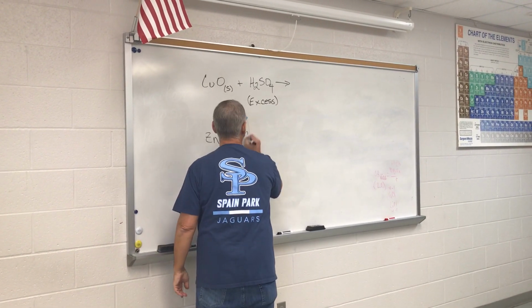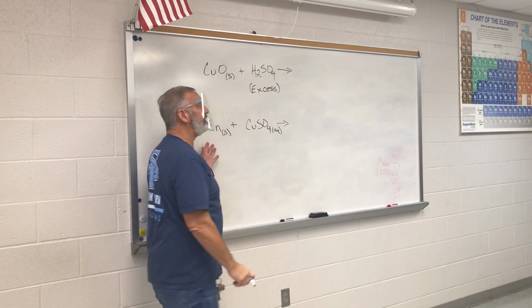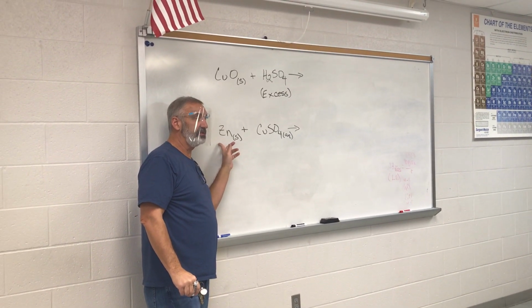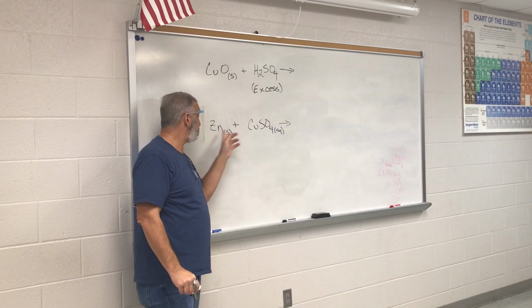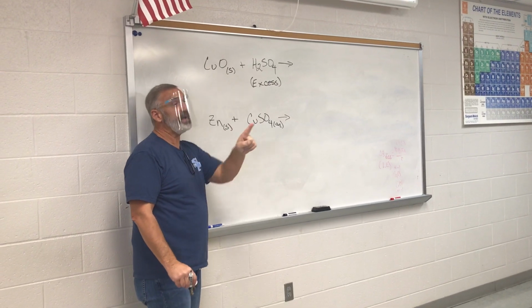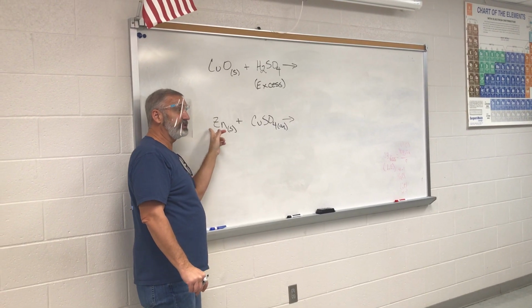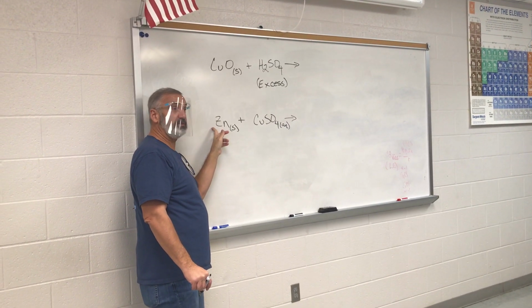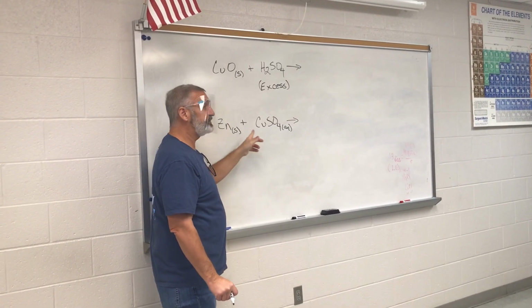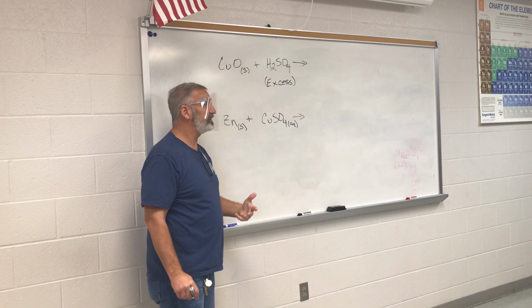Now, I don't like to give too much away. So we should be able to do that. What are any gases going to be produced in this one? In zinc plus copper sulfate. It felt like there was. Well, exactly, we observed that there is, but from this reaction, are there going to be any gases produced? No. What's the only two things we're going to get? Copper and the zinc sulfate. So the red that you're starting to see forming is the copper.